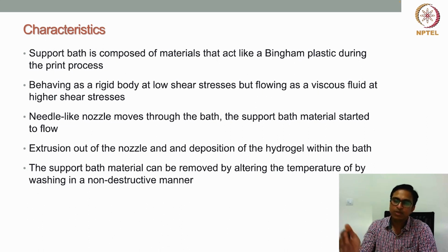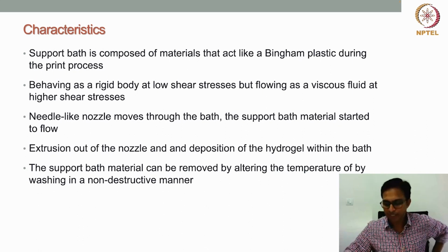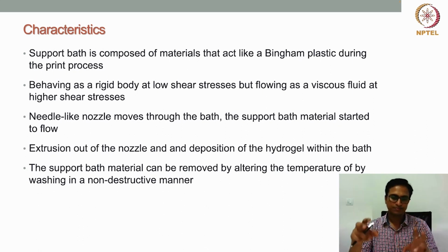So that kind of material we can very well use as a support bath material. Also, if the support bath material is water soluble or soluble in buffer or media, then we can simply wash it in a non-destructive manner, and it can be very well removed. So this is, in a way, the whole concept of 3D printing in a support bath.